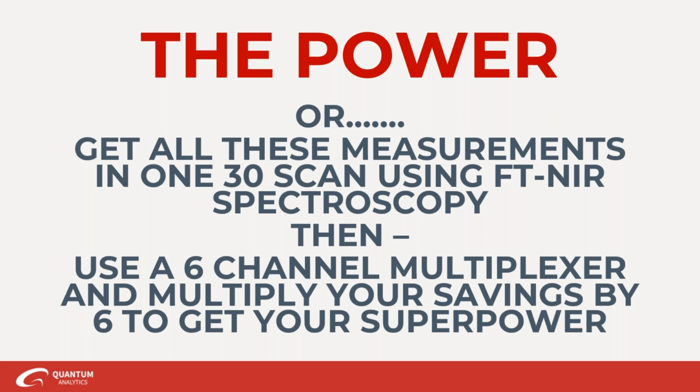So if you look at one of those and you see 3 groups, and then one of them's way out in left field, then something's wrong, and you want to take a closer look at that. Maybe you didn't have your sample placed right.